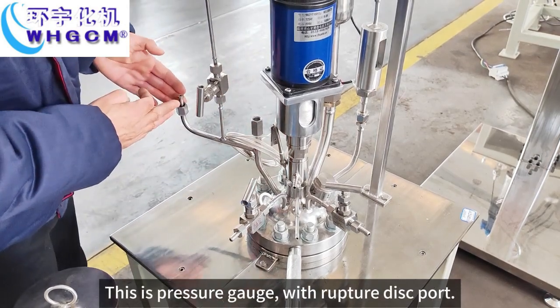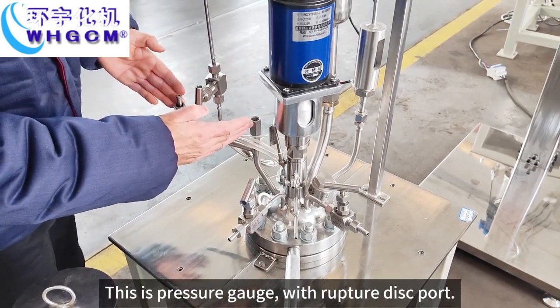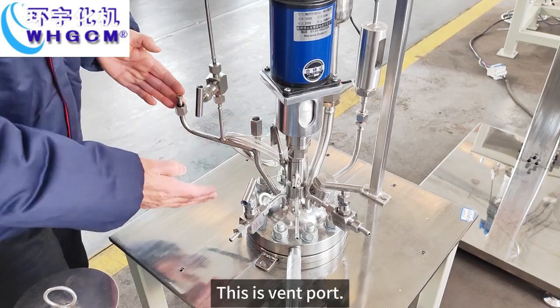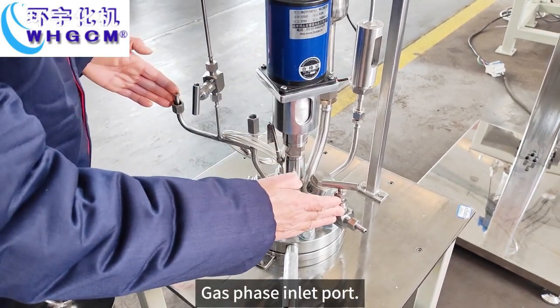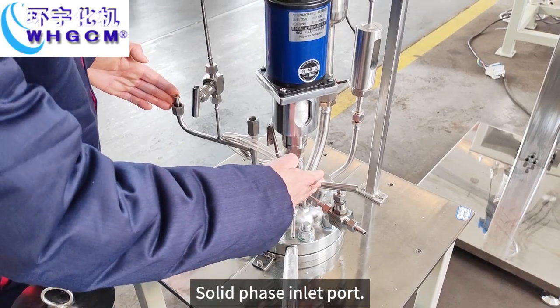This is the pressure gauge with rupture disk port. This is the wind port, gas phase inlet port, solid phase inlet port.